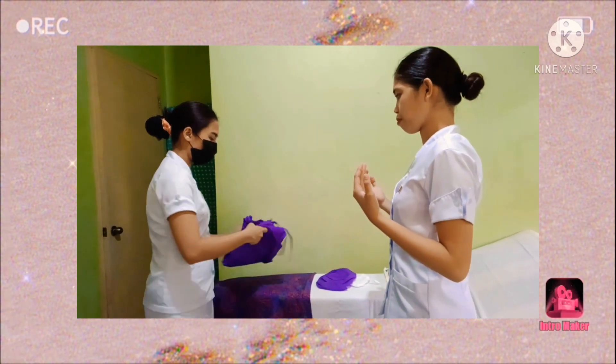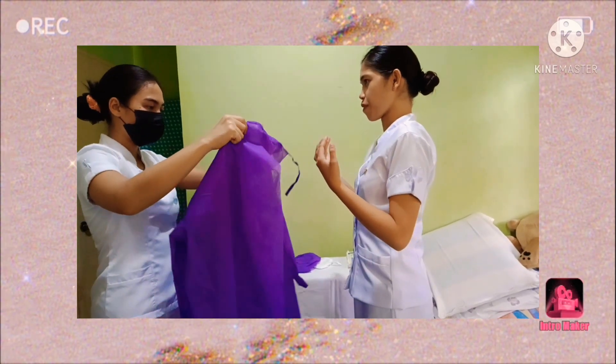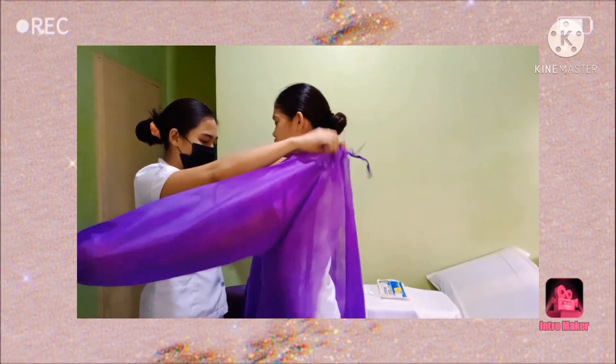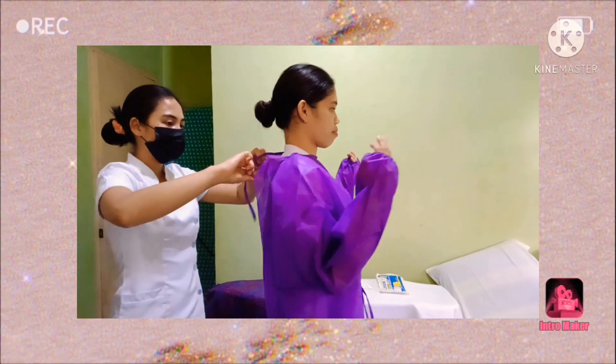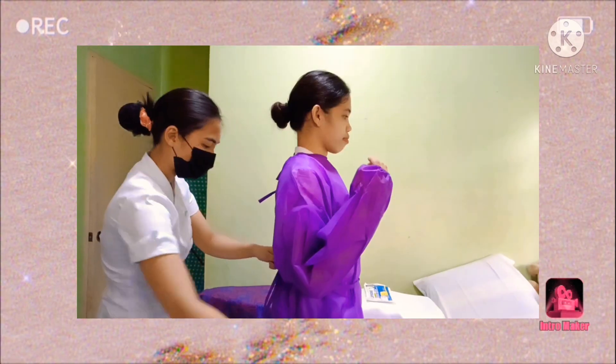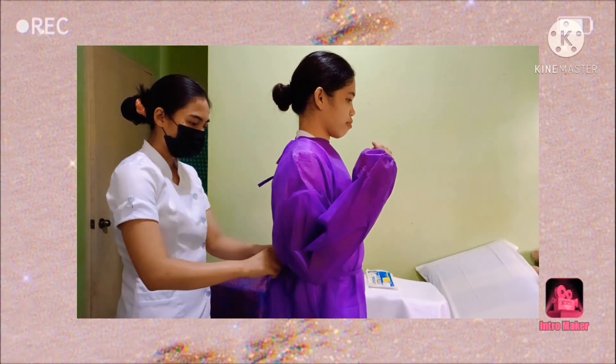The next step is to put on the isolation gown. Tie the ties and ask for assistance from other healthcare personnel. Isolation gowns will reduce the risk of contamination during exposure to patients with communicable or contagious diseases.